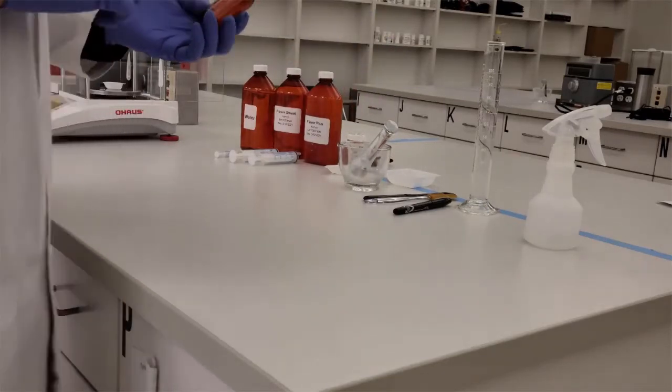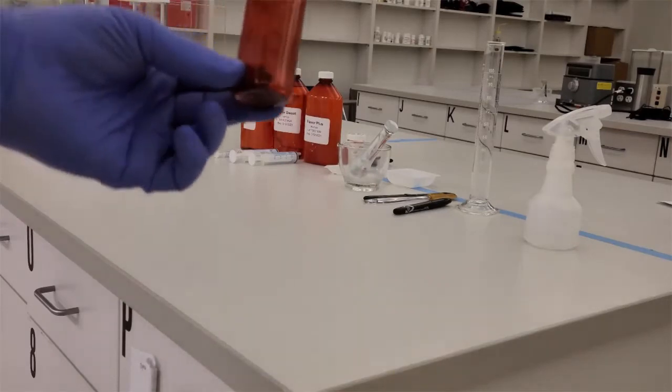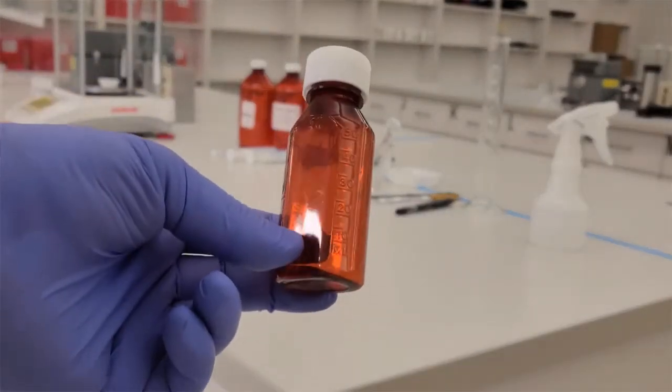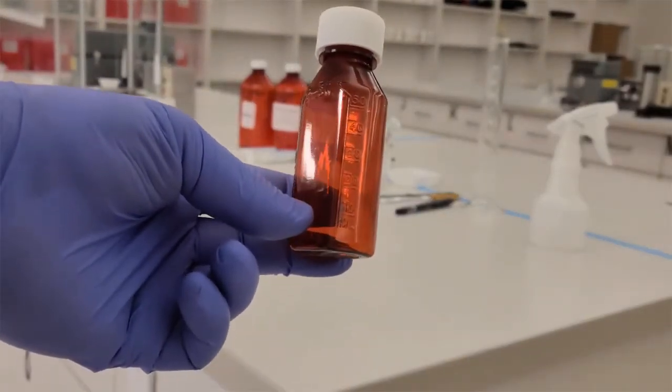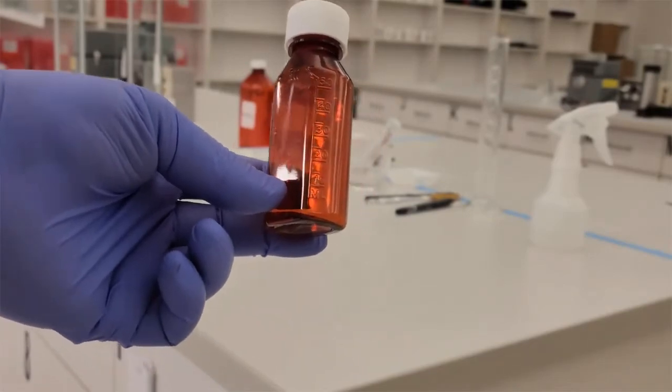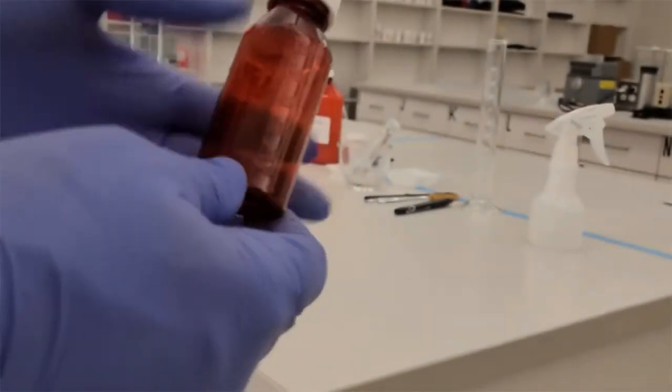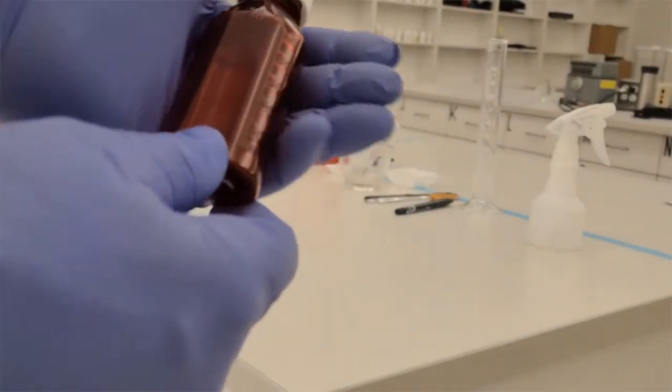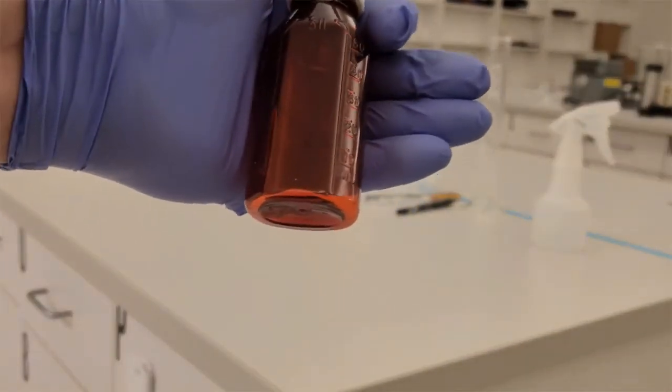Now I'm going to first calibrate a prescription bottle. The amber bottle that you see here does have markings on it. Those markings are estimated. They're good for dispensing products, but they are not appropriate when we are compounding a product to a final volume. So we can't use those markings.